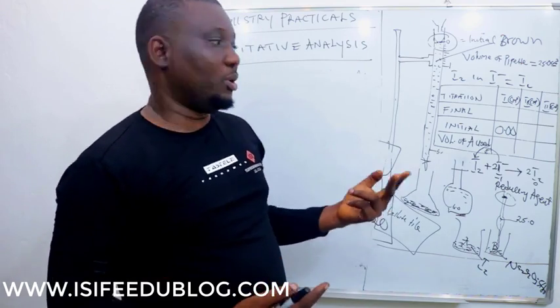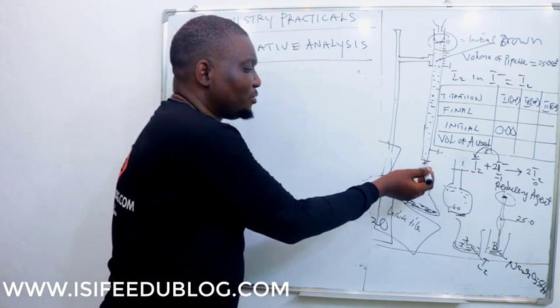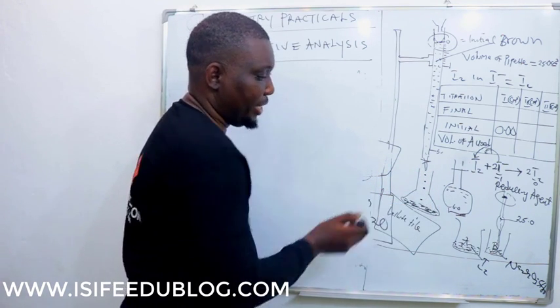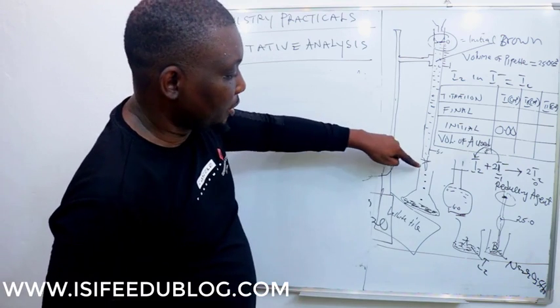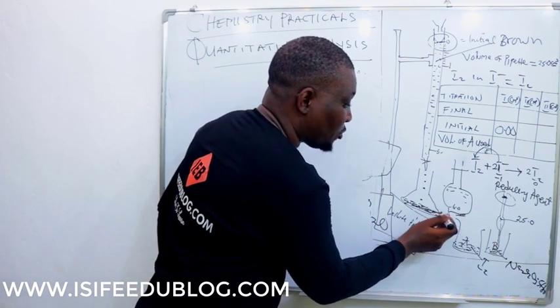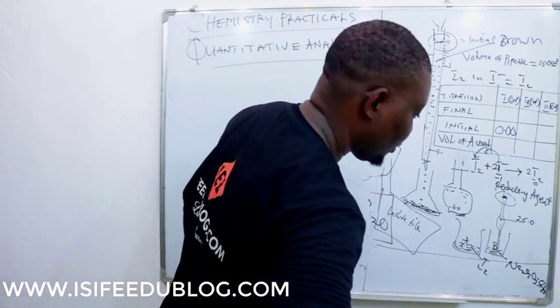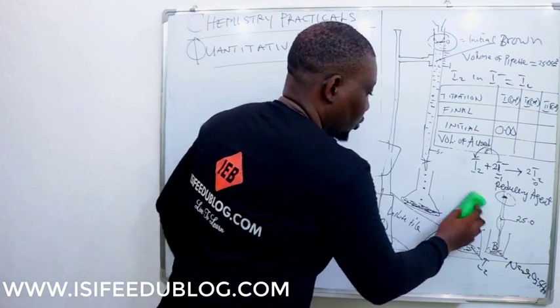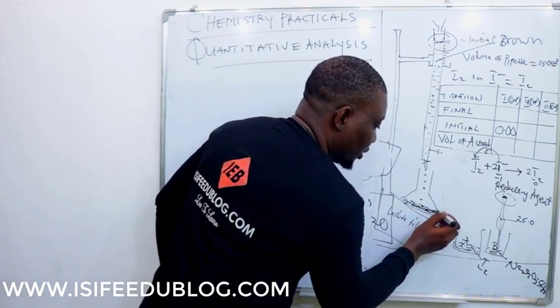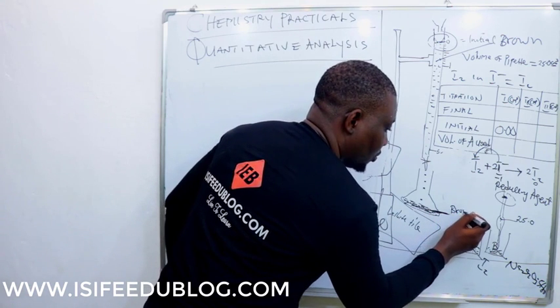The first titration will be like, you start titrating. You can know there will be a calculated amount of iodine that will go in here. The moment iodine is going in here, the color of this will change. You have to be very, very observant in this reaction. The presence of iodine going in here will change the color of the mixture in this beaker to brown.